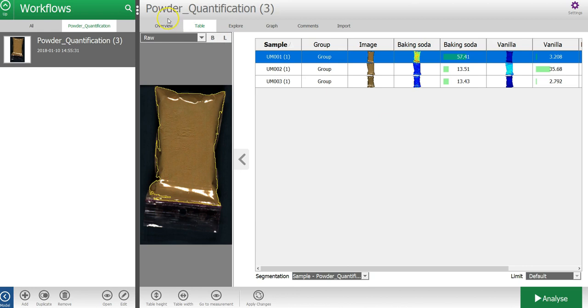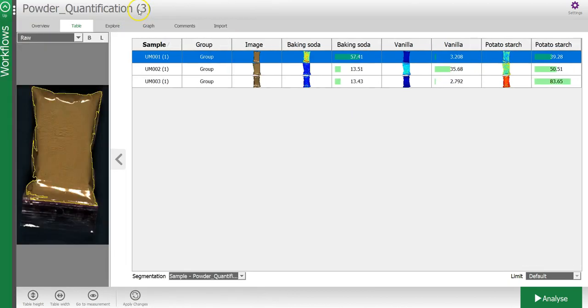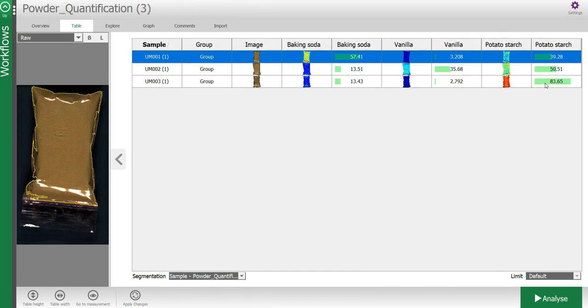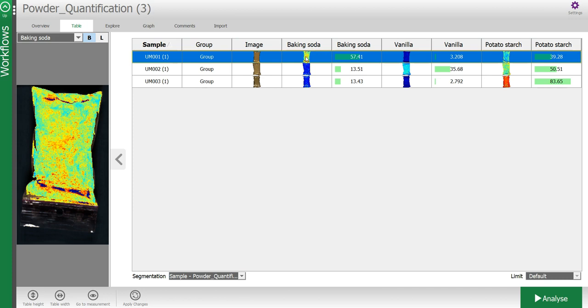A table is generated with the predicted values for the properties baking soda, vanilla, and potato starch for each of these unknown samples. By clicking on the property in the table, I can display the prediction on a pixel level.